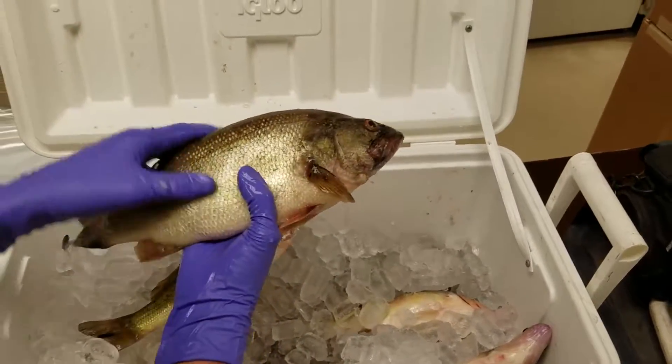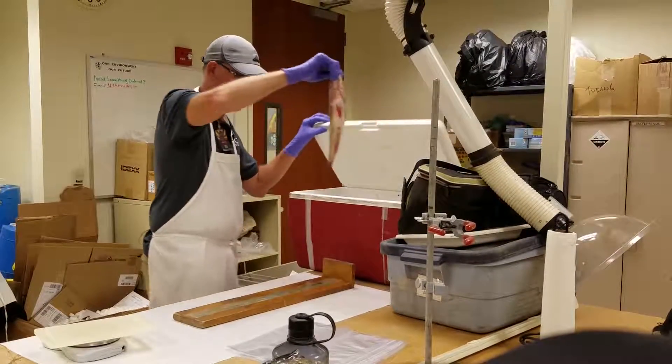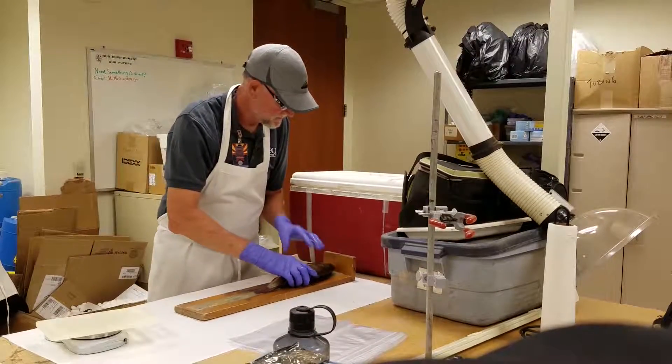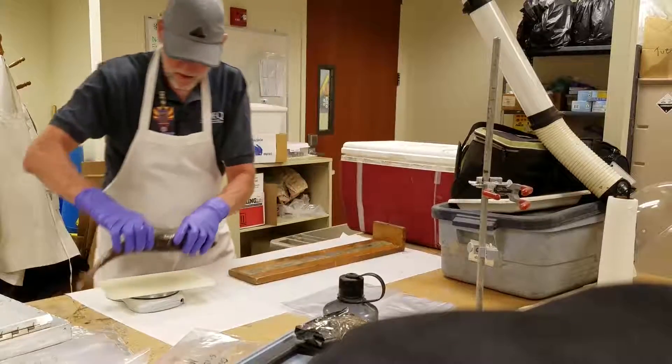Once we have the fish from the lake, we bring them back to the laboratory. We have to take a couple of measurements on the fish before we do the subsampling. What we like to get is length and weight.